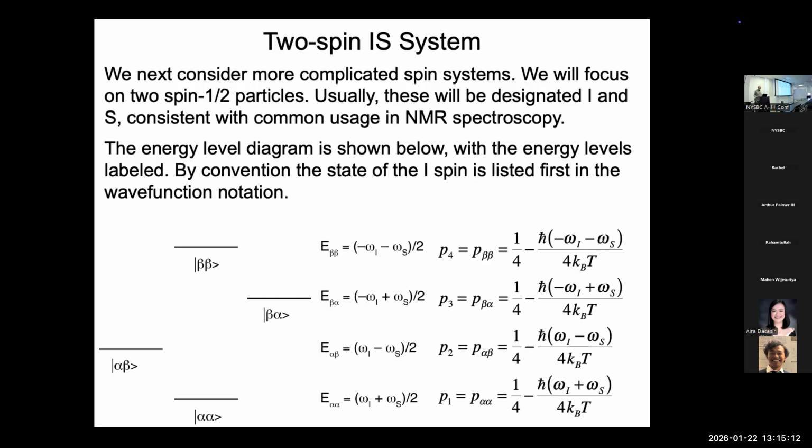and get on to what our real problem is: we have more than one spin. And if we just think about the amide hydrogens, if the protein is enriched in nitrogen 15, there's a nitrogen 15 spin connected to the amide hydrogens. There's a 3-bond scalar coupling between the amide hydrogens and the alpha hydrogens that is important. So we have to know something about more than one spin.